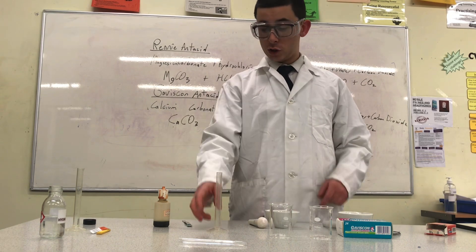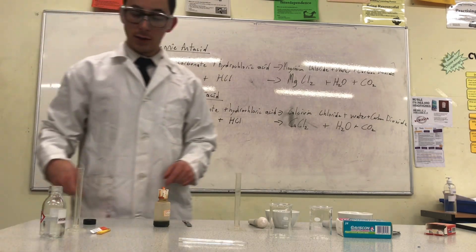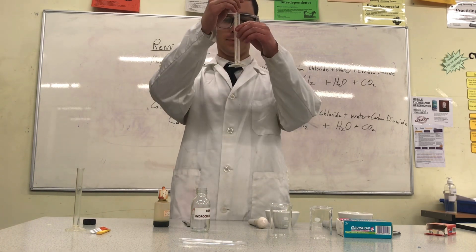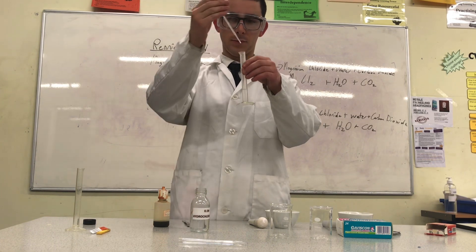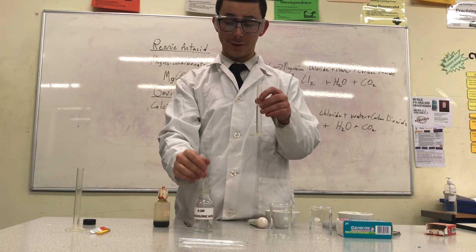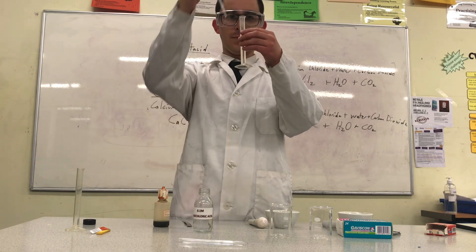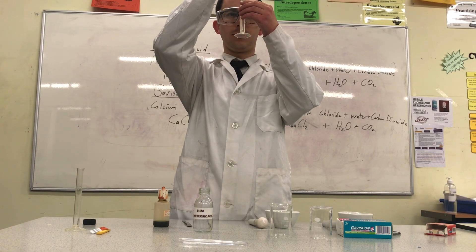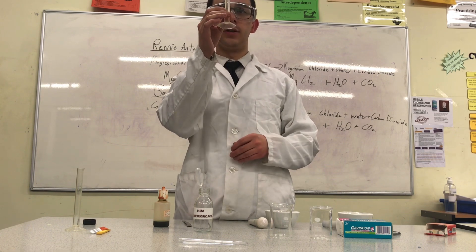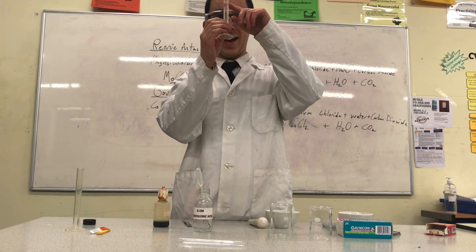My next step is to measure 10 milliliters, or 10 centimeters cubed, of hydrochloric acid. Using a pipette, I will remove the acid from its container and put it into my measuring cylinder. It's much safer to transfer the acid with a pipette than to pour directly from the bottle. When measuring liquids or aqueous solutions, you need to make sure the meniscus — the curve in the liquid — is right at the line where you want it to be. My meniscus is right at 10 milliliters.